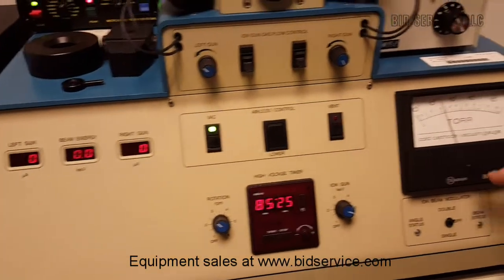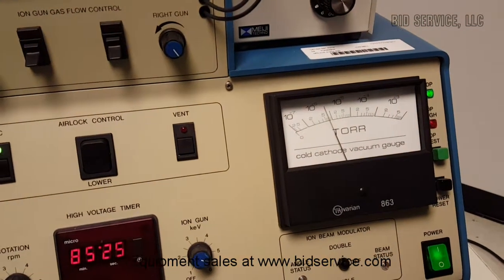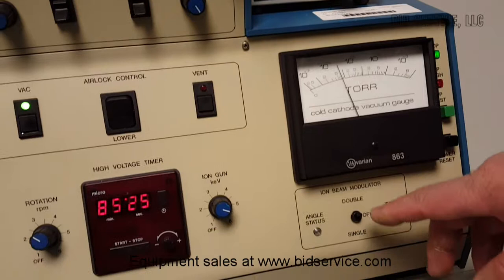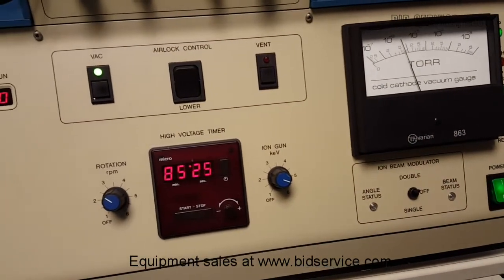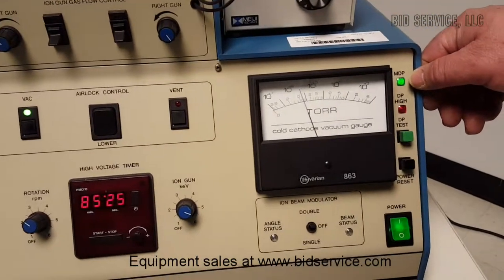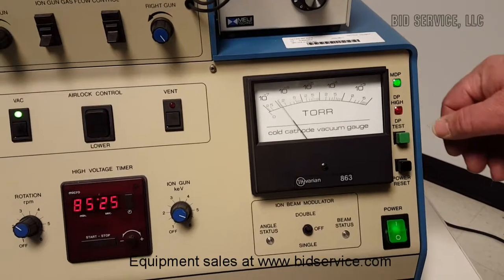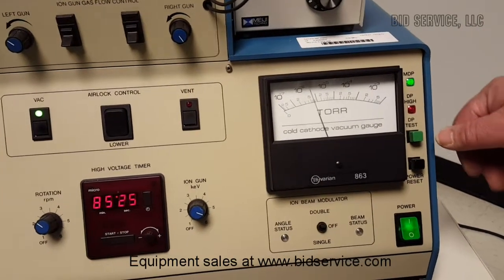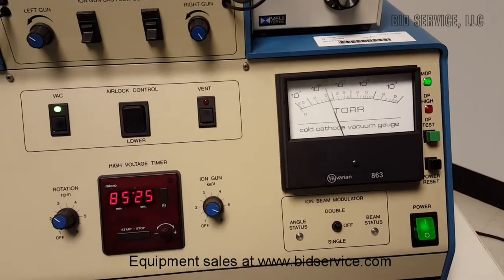Over here you have your high vacuum gauge — you can see we're around seven in the ten to the sixth range. And here is where you select whether you want to do a double or a single beam. Over here is your indicator to let you know that your turbo pump is running, and this basically lets you know you've got pressure to the system, and then you've got your test and power reset going to the turbo controller.